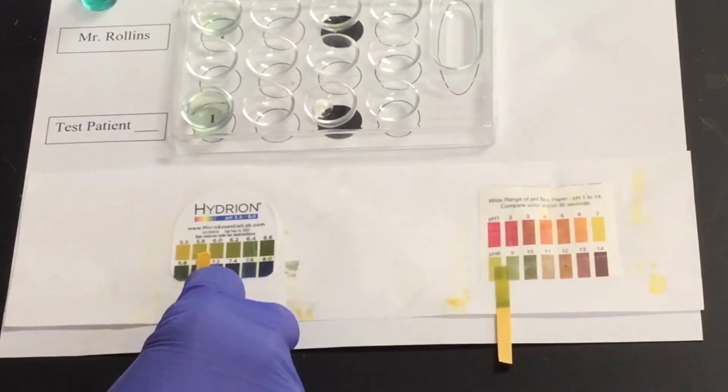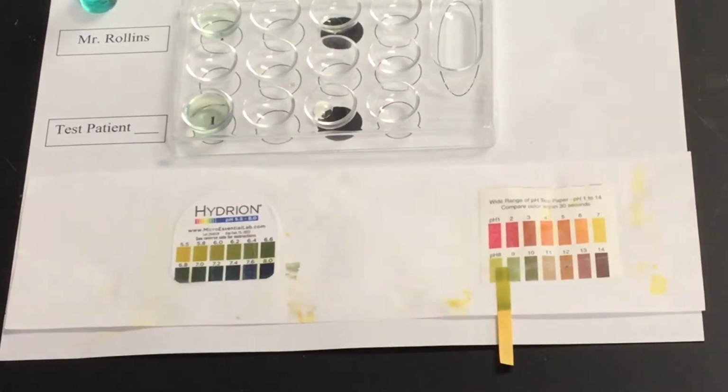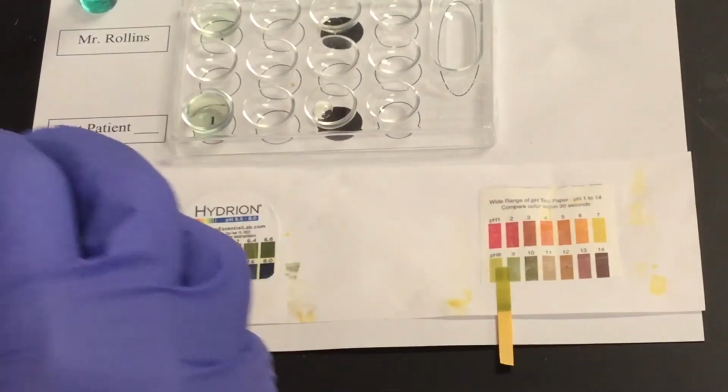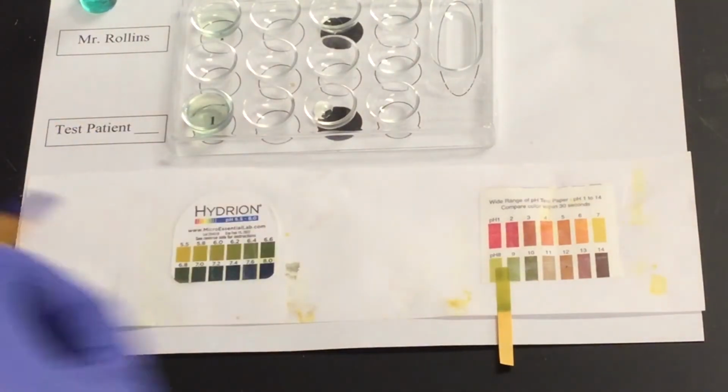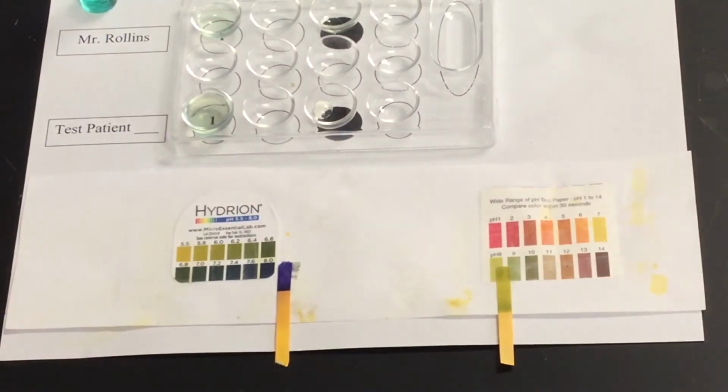Remember, our second type only goes up to 8. So right away, I know that this had better turn a really dark blue or purplish color in order to make sure that that is correct. When I dip that in and look at my color, it's actually not even blue. It's more purple, so I would say it's higher than 8 on that particular scale. So maybe give it about 8.5. Both of them match up.